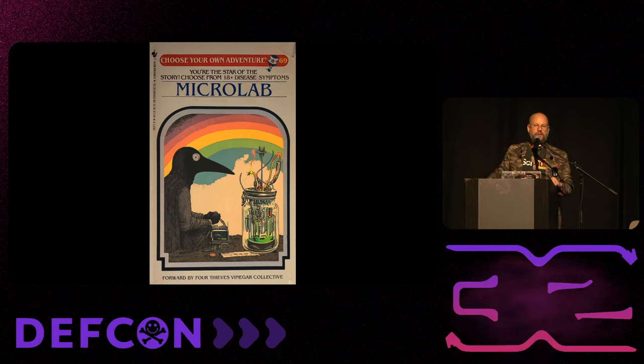Again, one other thing about this that I am super excited about is that additionally, if you have some sort of chemistry that you want to do that maybe isn't so complicated and doesn't even require something as sophisticated as the MicroLab, this still supports it. If you just need something to talk you through a process and have some contingencies, make sure you check XYZ, you can still trade ideas this way. So when we figure things out, we can tell each other and we don't even have to meet each other. We can all just post it and be friends.